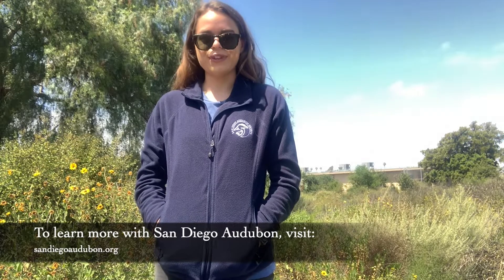I'm doing my dissection by myself today, but hopefully you're doing yours with a friend or some classmates. It's always really fun once you finish looking at your own owl pellet to spend some time looking at what other people found. Even though these owl pellets come from the same type of owl, no two are exactly the same. So definitely take some time to compare with classmates what type of bones you were able to find in your pellet. Thanks for joining me today for our owl pellet dissection. Now that you have an idea of what to expect, once you have your pellet, your tweezers, your bone identification sheet, and your petri dish, you can go ahead and get started. Hope you have fun exploring and find lots of really cool stuff.